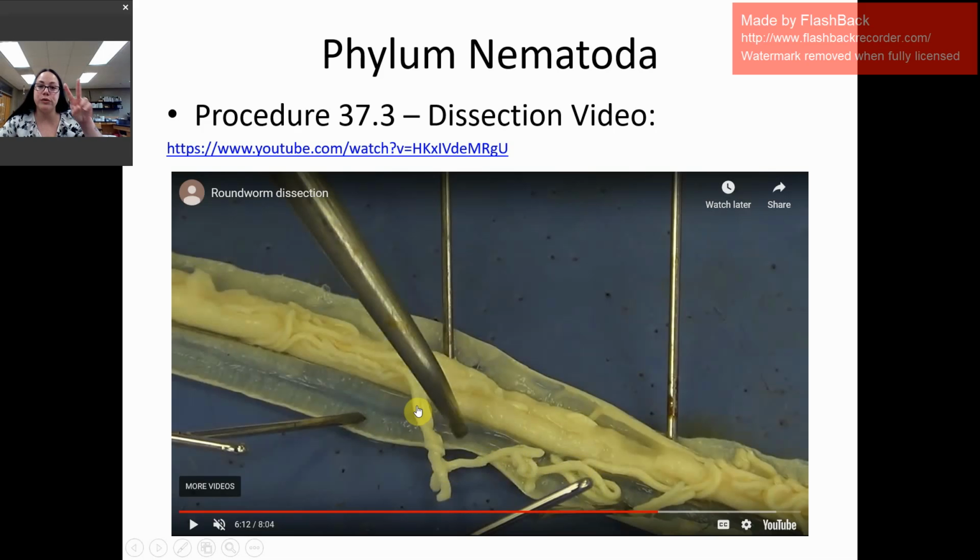So you have two uteruses or uteri, so two sets of oviducts, and then they are going to keep going. From thinner noodles, you can see here a little bit smaller, but it should become way smaller, thin like hair, thin noodles. And those are the ovaries where the eggs are being produced.